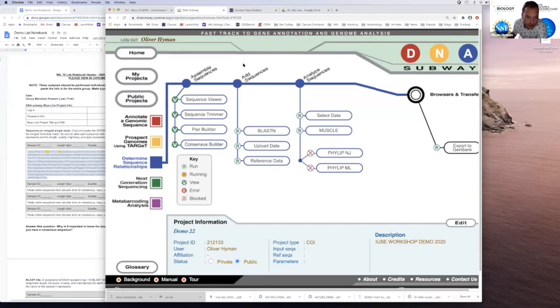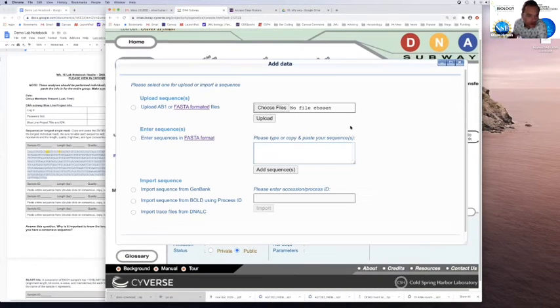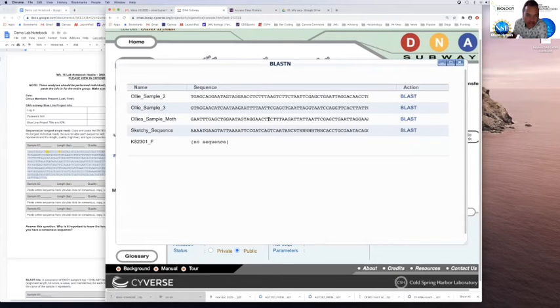So now we're going to go to this next stop called add sequences. So I'm going to hit this thing called BLASTN. Essentially, BLASTN is a Google search for your DNA sequences. So this is automatically dropping your sequences into an NCBI database BLASTN search. BLASTN stands for blast nucleotide. So I'm going to go and hit this BLASTN thing.